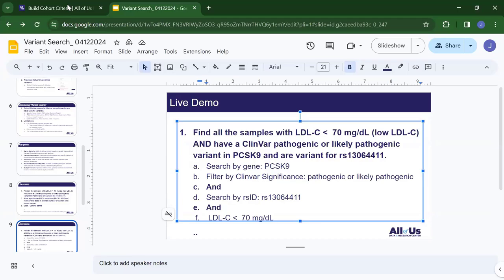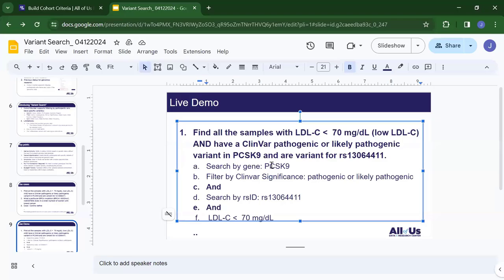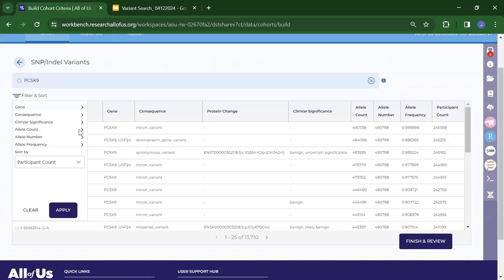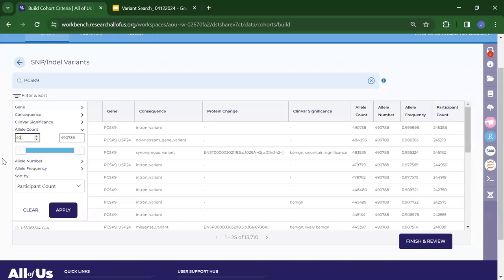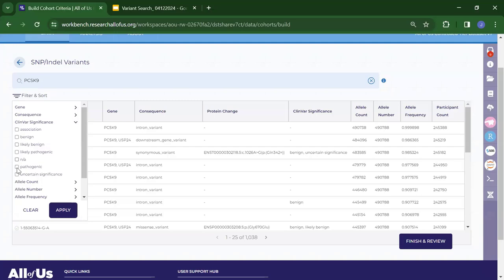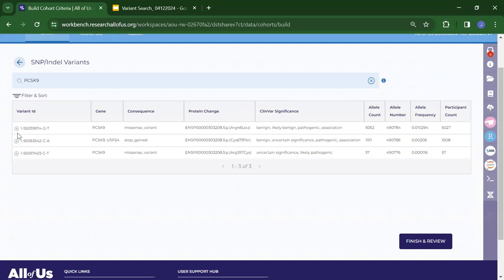I want to filter by clinical significance. I can actually do all this filtering in one place — let me go back. I search by gene, filter by allele count of 40 and apply, and also filter by clinical significance — pathogenic and likely pathogenic — and apply. That's great: we now have three variants left. That's much easier.